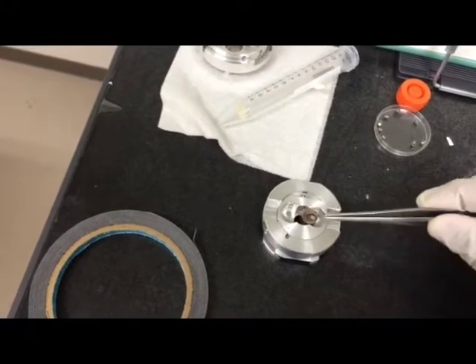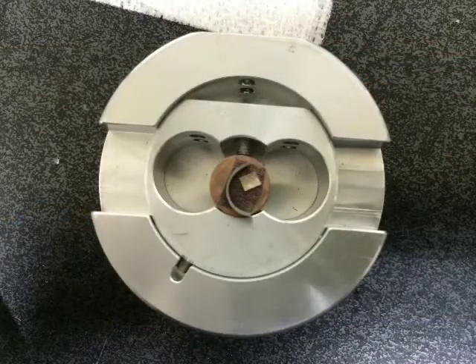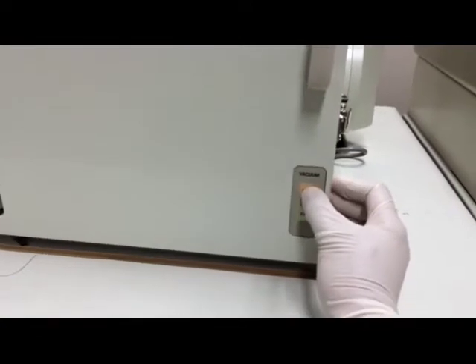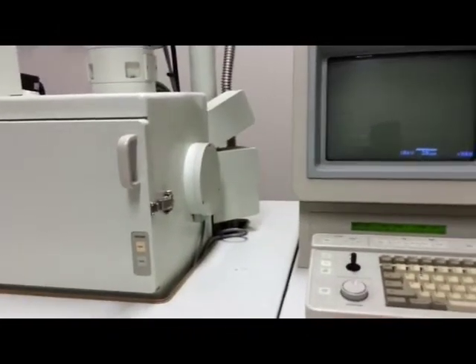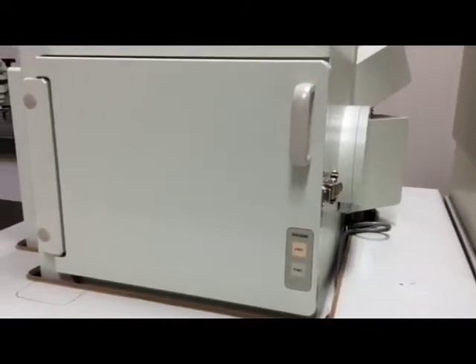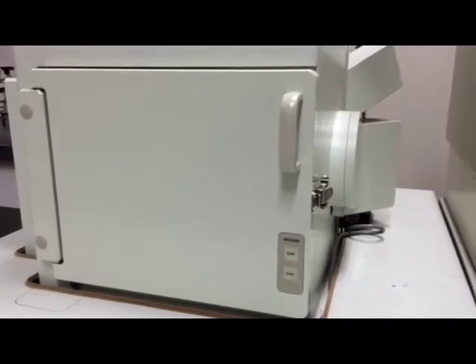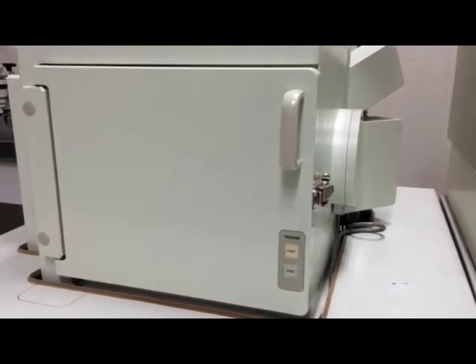Put the sample here in the center. Input the sample into the SEM. That is why it is under opened. Now you're done.